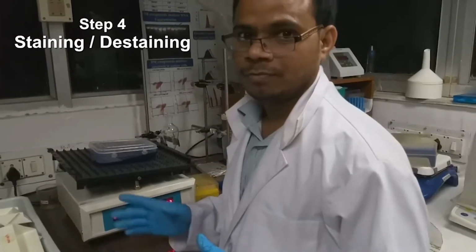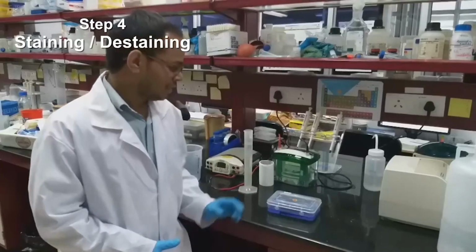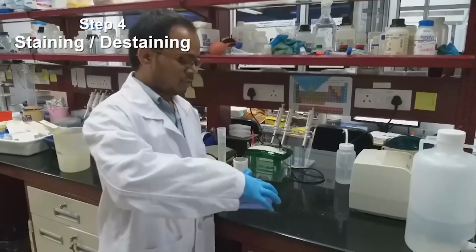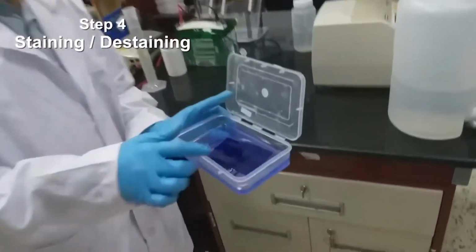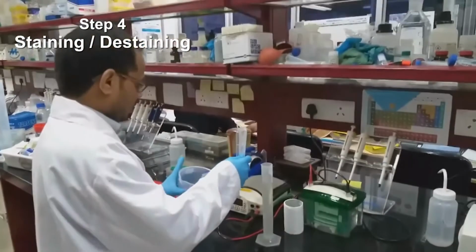So once the time is over, after 2 hours, we will remove this solution. Now we kept it 2 hours in staining solution. As we can see, the staining is over. Like you can see, the gel has completely turned blue. So we remove the solution.